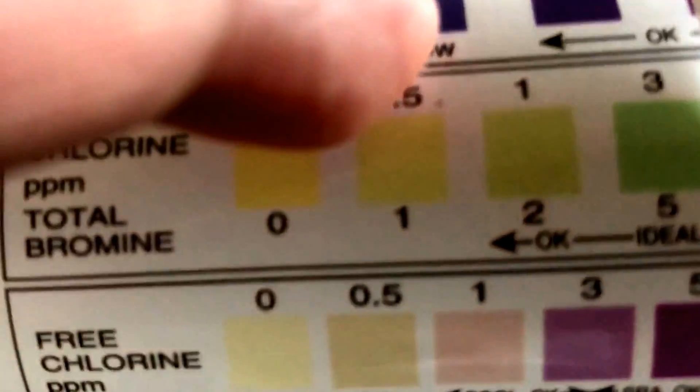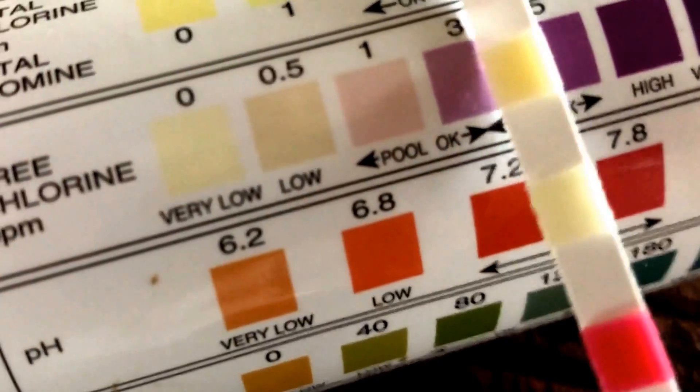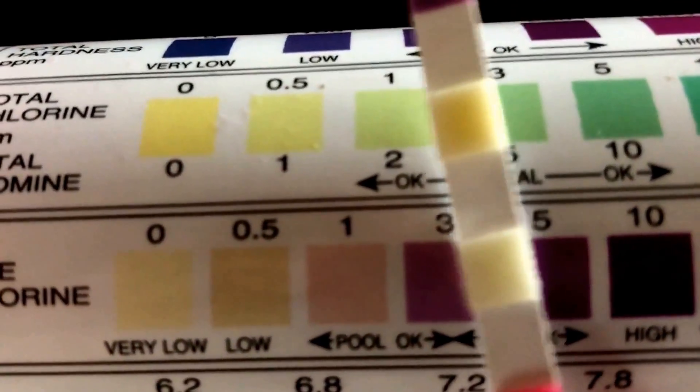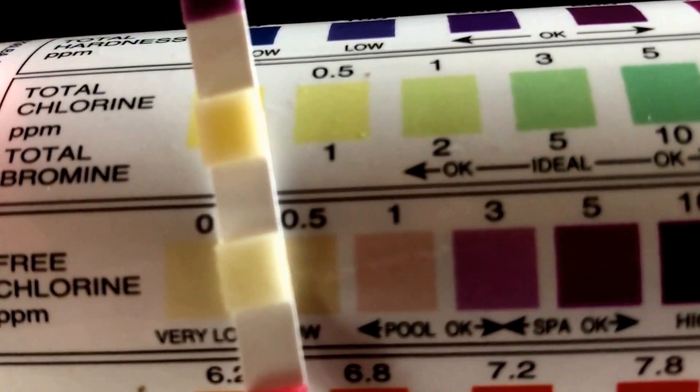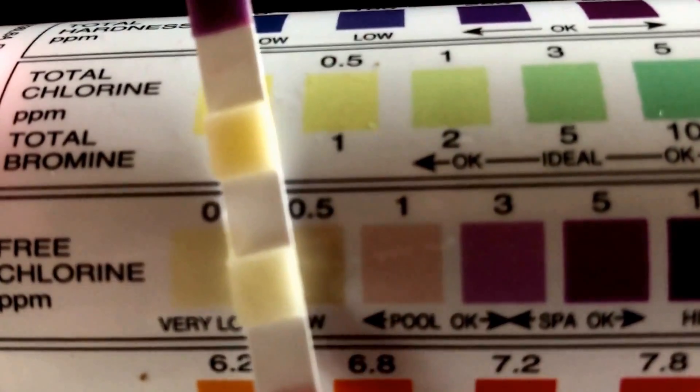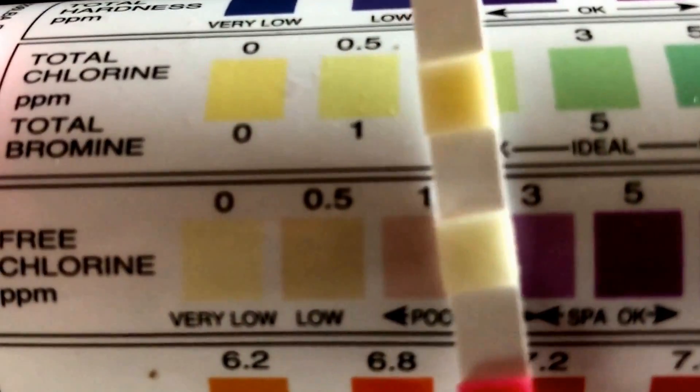The third metric is free chlorine. For free chlorine, I am actually very low on that, so I need to add chlorine to bring it up to about this color here.